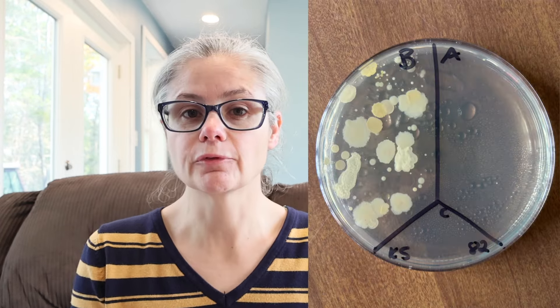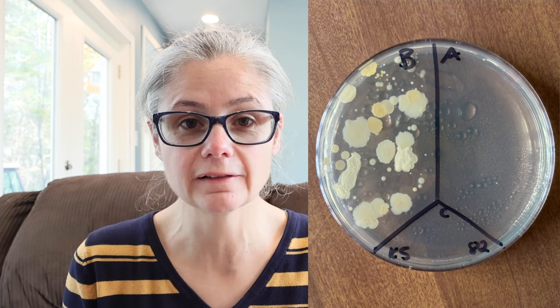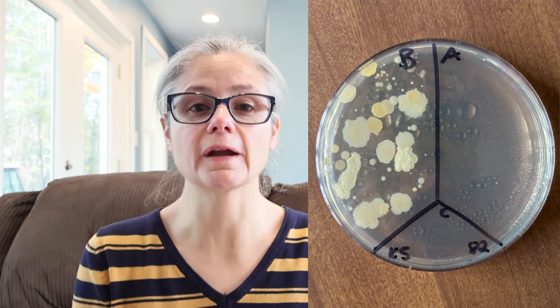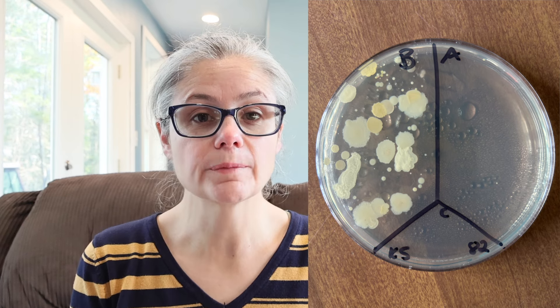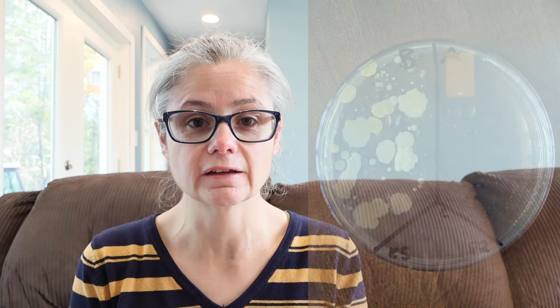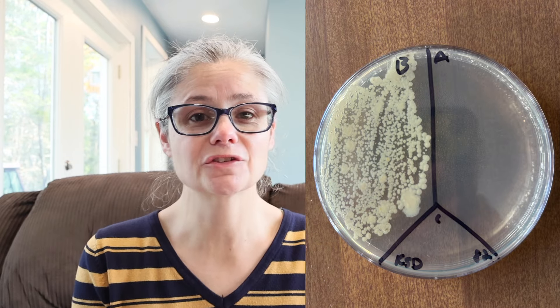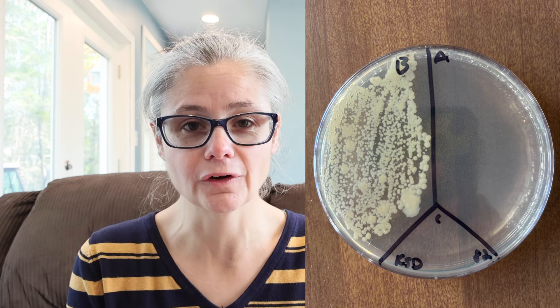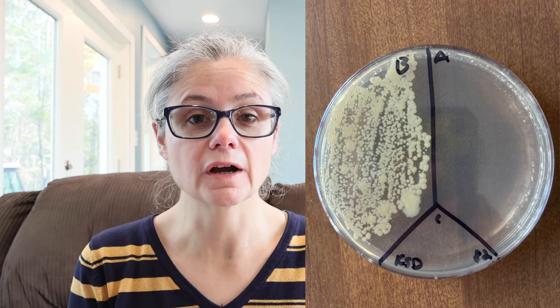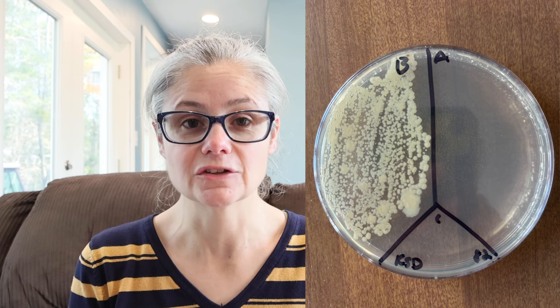Let's look at the results. The kitchen sink: in the before section we can see a lot of bacteria, including different types. In the after section there's no bacterial growth at all. So the 3% Pure Oxy Life pre-diluted did an excellent job removing the bacteria from my kitchen sink. Kitchen sink drain: in the before section we can see a lot of bacteria, and in the after section there's no bacterial growth at all — an excellent job removing bacteria from the kitchen sink drain.